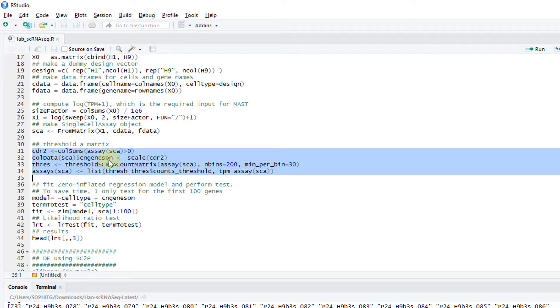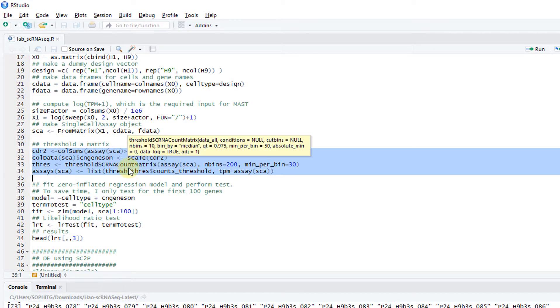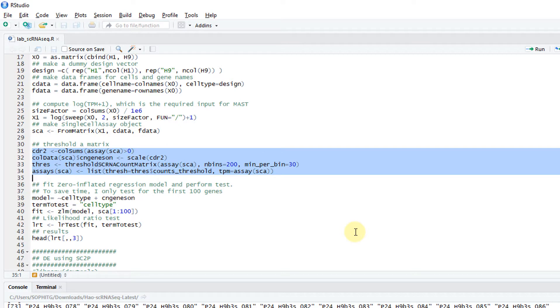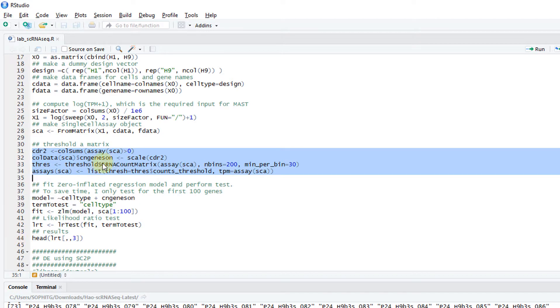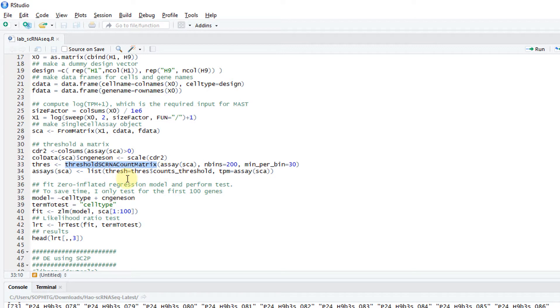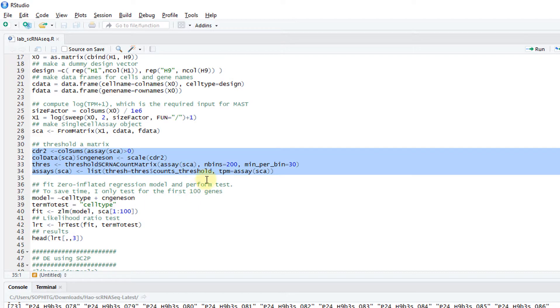MAST requires you to threshold the matrix. Basically for each value, you compute whether it's presence or absence, whether the expression is there or not. Remember in a single cell, the expression is a little more complicated than bulk. The gene expression has two phases. The first one is on and off. You could have the genes completely off. But then when the gene is on, you could have quantitative differences in the level of expression. This line, threshold SCR and a count matrix, is basically used to determine whether the genes are on and off for all the genes in all the cells.